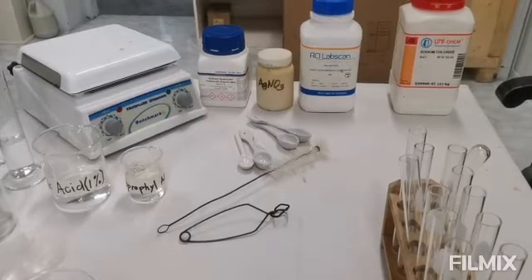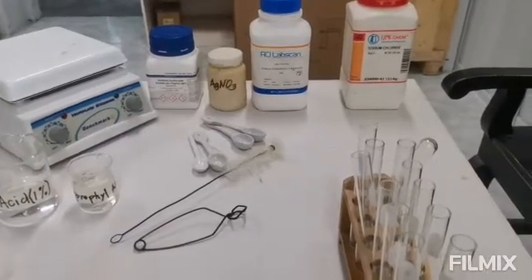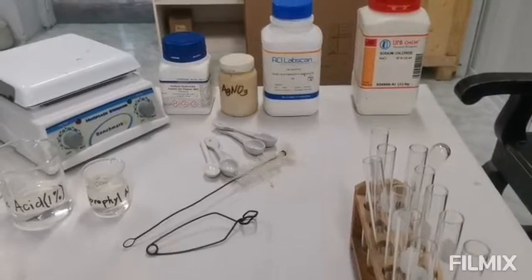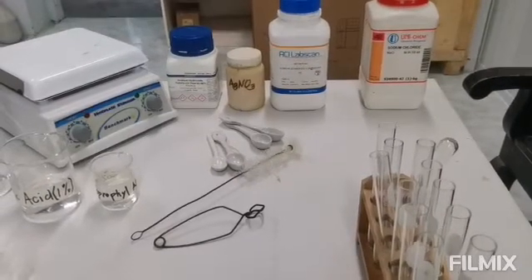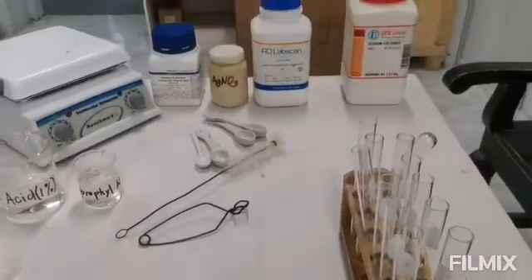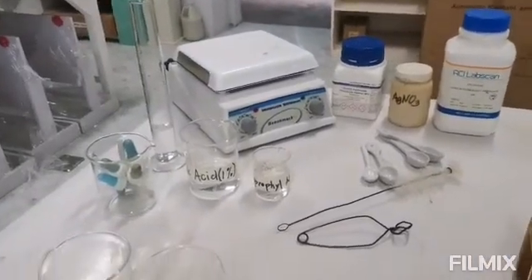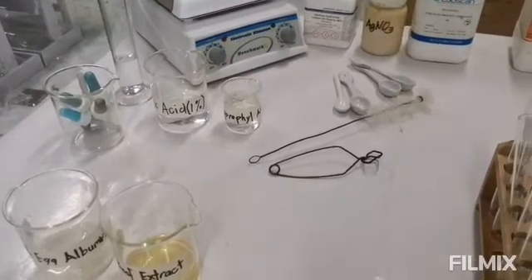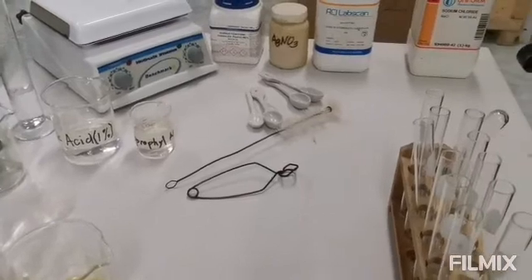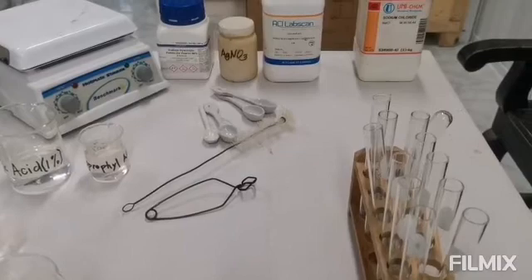Welcome again to our laboratory. This will be the first recorded laboratory experiment that you will have this semester. In front of you are the apparatus and the chemicals that we are going to use in this experiment. Our experiment will be working with protein, specifically first on the denaturation of protein.